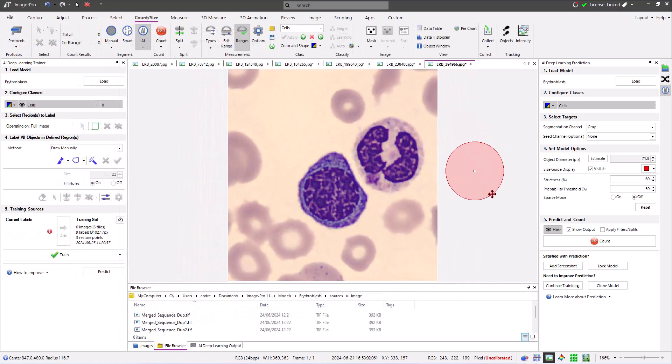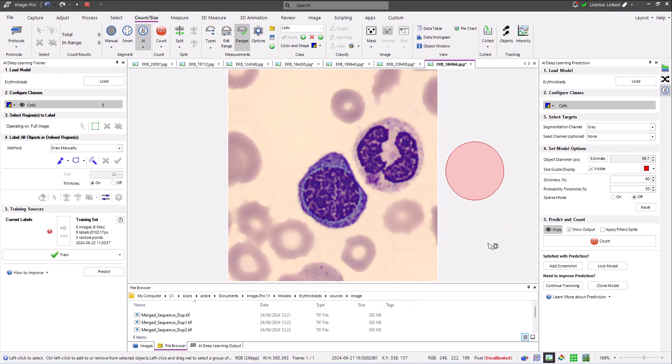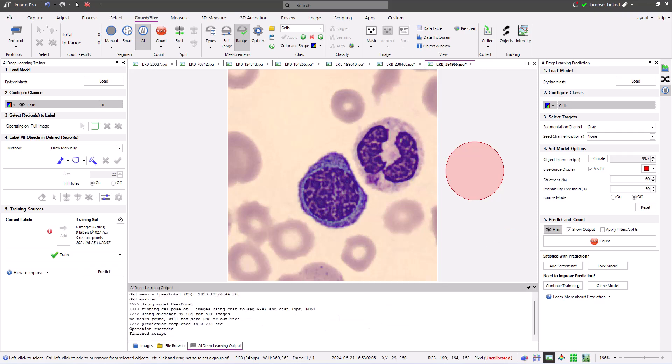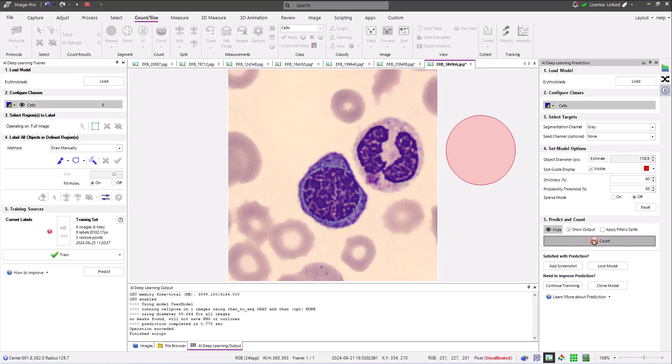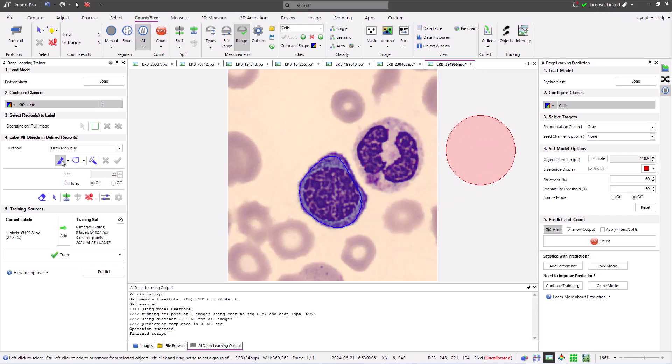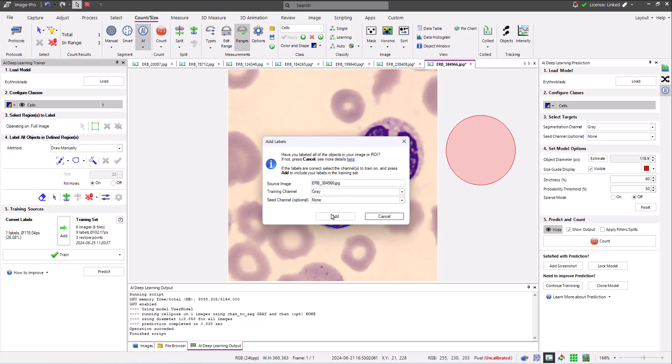The next step at this point is to open some new images that the model hasn't seen before, use the model to find objects of interest, make corrections and edits to the objects that the model finds, then add these corrected objects to the training data. Here I'm showing this speeded up for the benefit of this video.